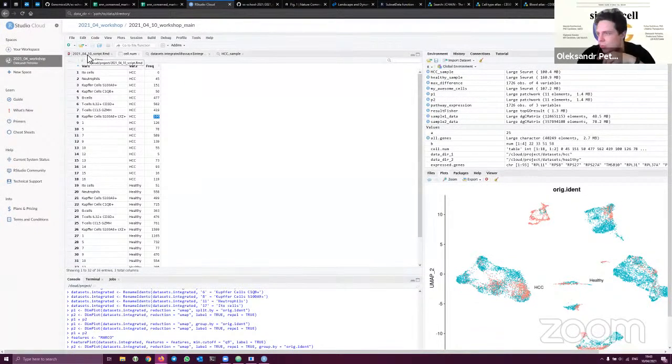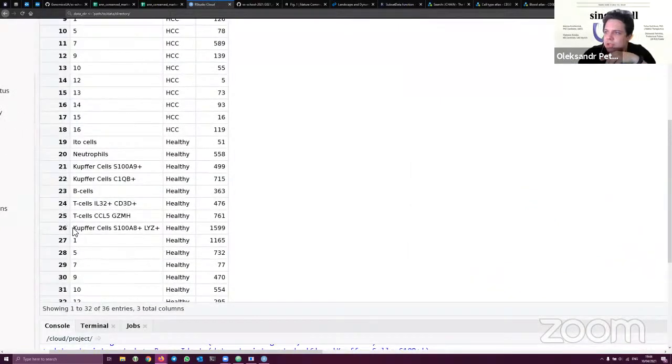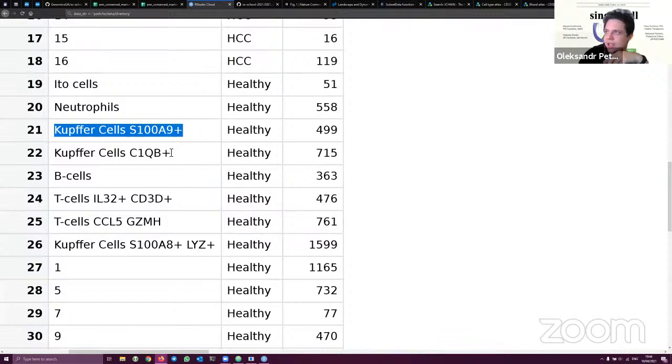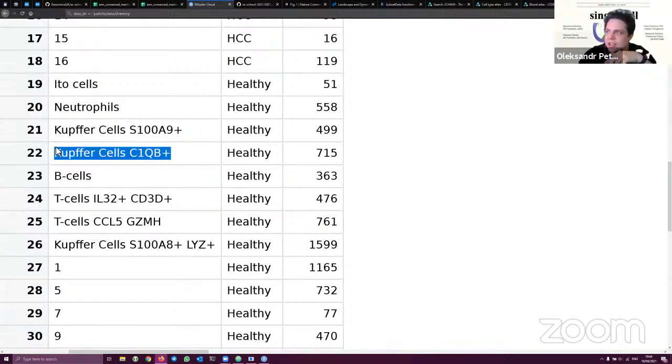However, there are of course more precise ways to calculate the number of cells, for example, flow cytometry. And actually, when you do single-cell RNA-seq analysis, you find cell populations which were not known before, because it's not possible to distinguish one Kupffer cell from another with histology, and there are 20,000 genes, so you unlikely can randomly target one marker, stain for it and distinguish it.